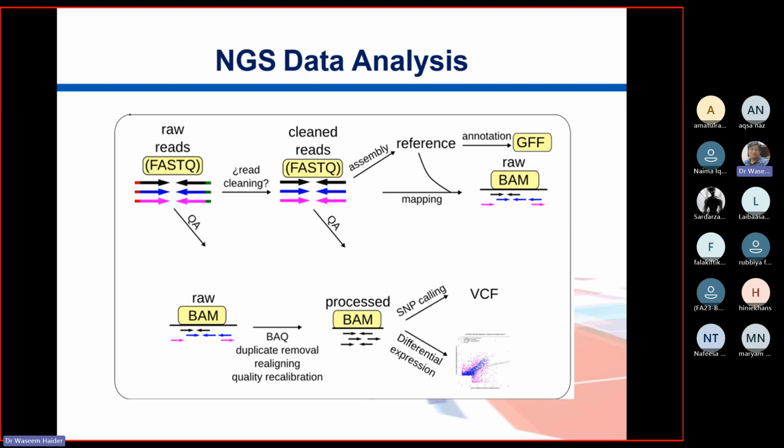Okay. Right, so then you get this raw BAM file after this alignment, and you remove the potential reads that can be the duplicates, and finally you get the reads which are finally remaining. So in that case, this thing is called a processed BAM, right? And then why these duplicates, they are here.